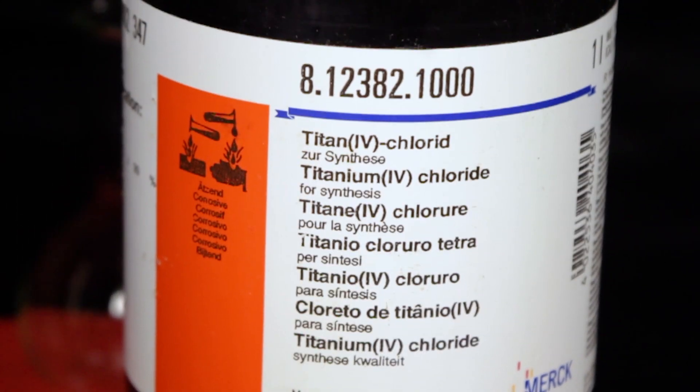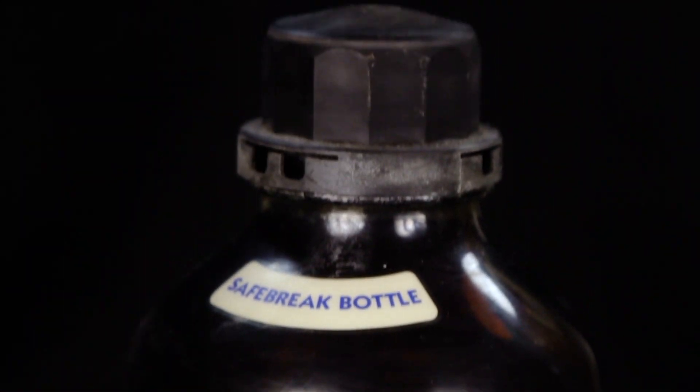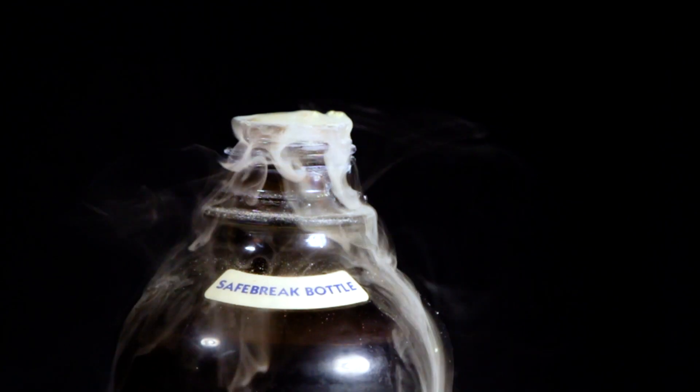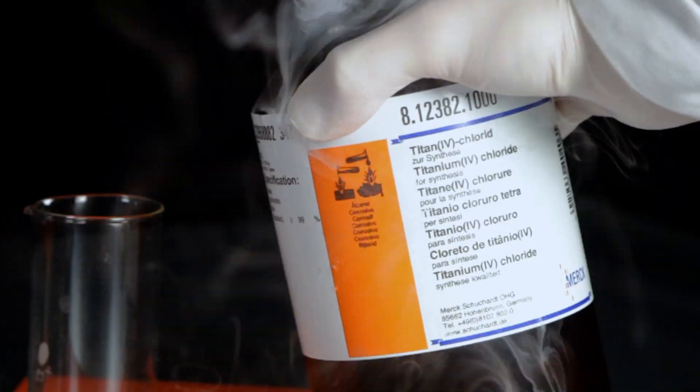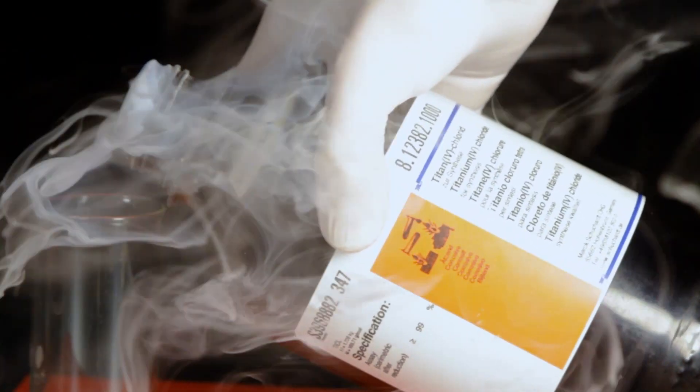Hey guys! The video about titanium tetrachloride takes the second place by the number of views on this channel, so I decided to show the interaction reaction of titanium and liquid chlorine.